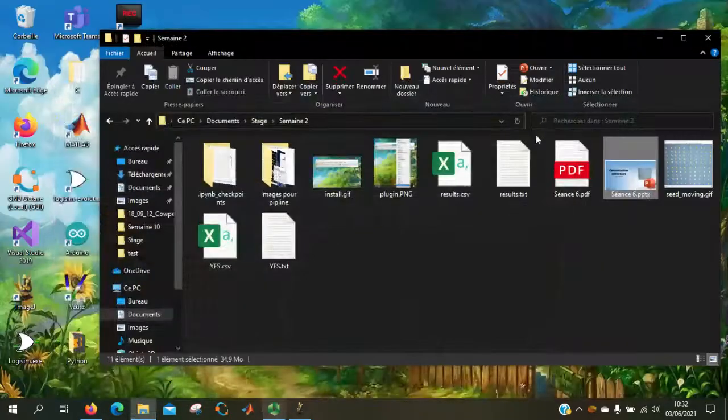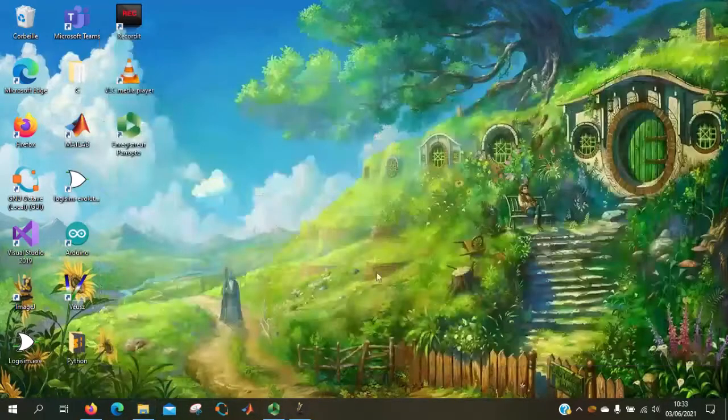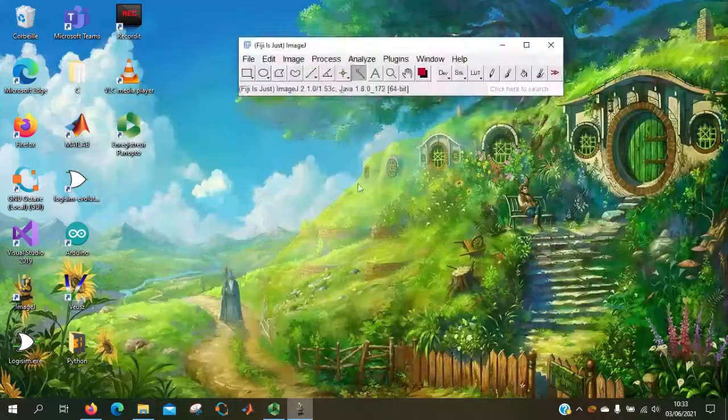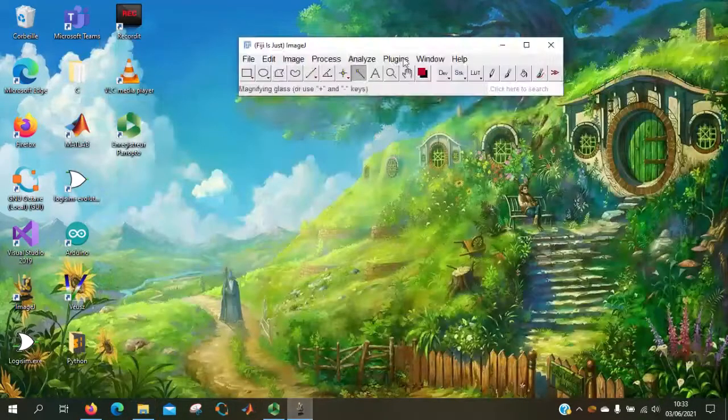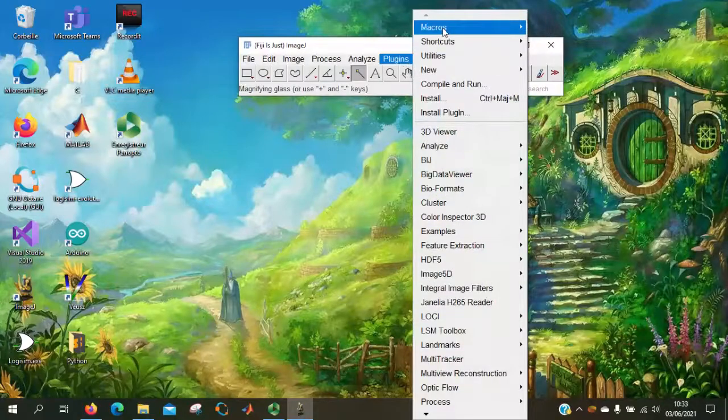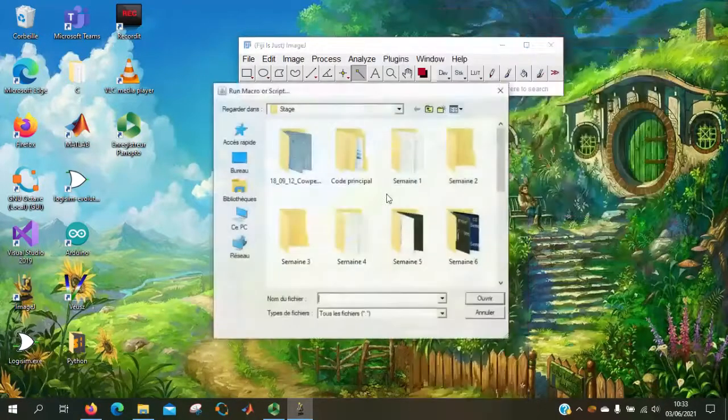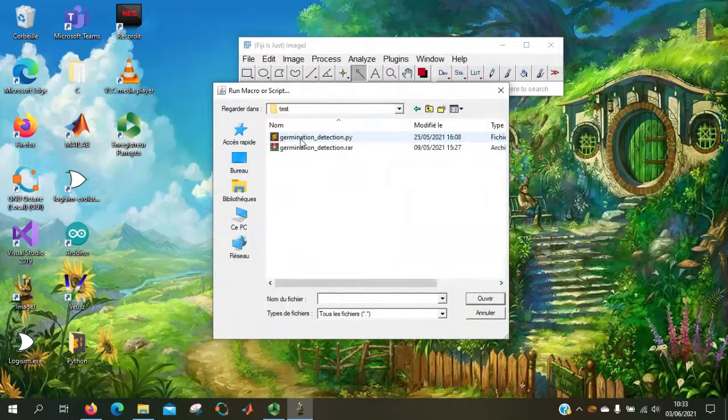So I can show you directly the macro on ImageJ. So plugin, macro, run.